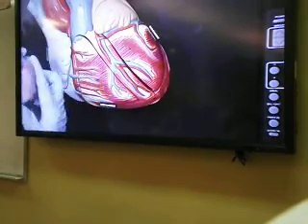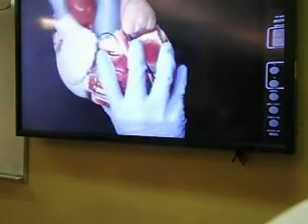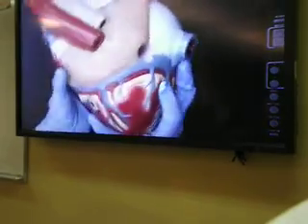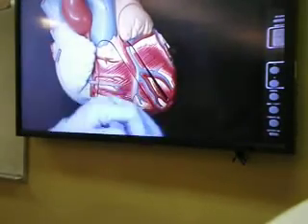If I am looking from the posterior view, we also have the posterior interventricular sulcus, which we will also see on the sheep heart, and that will almost come close to the apex. So that will be ending close to the apex. And once we talk about that, a few other things.